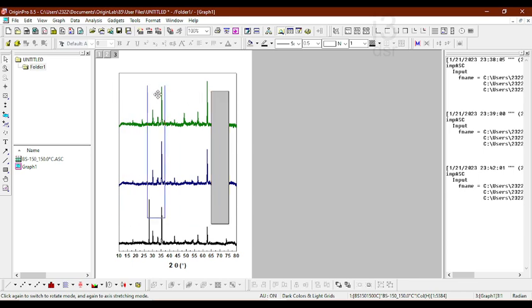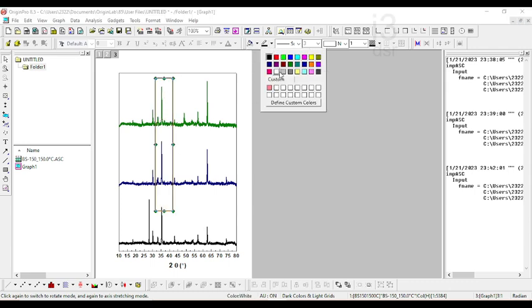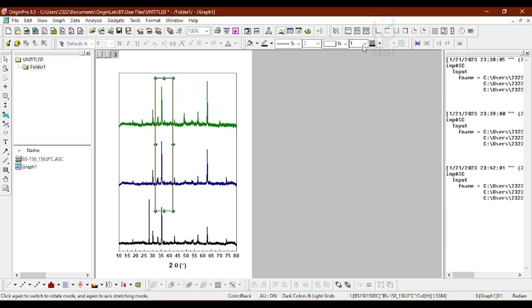I have to now customize this. The width of this box is going to be... this is the color fill. But if I give none, it is going to be none inside. The color should be a little of fill, so I give black.